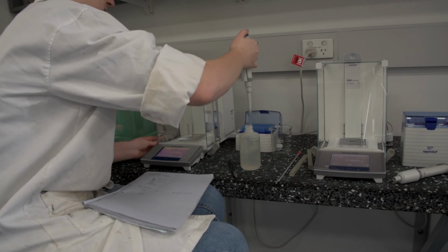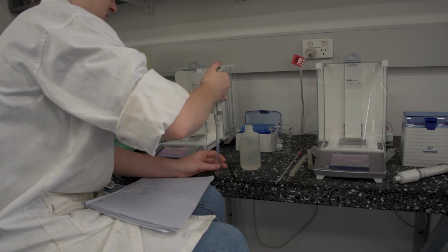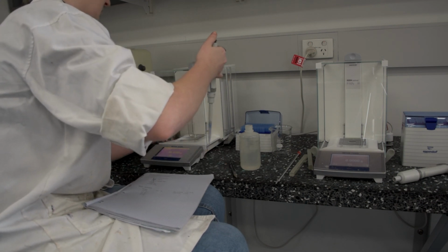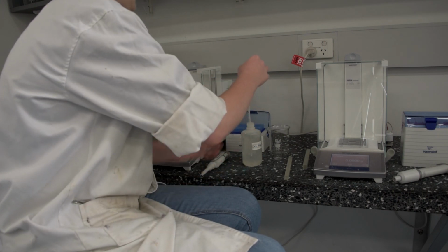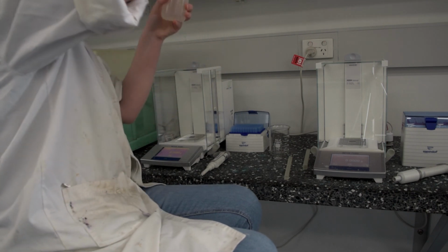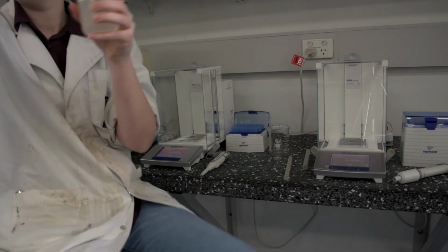To calibrate the autopipette, specific volumes of water were pipetted into a vial and weighed. The temperature of this water was measured, so the density of this water may be looked up in reference books such as the CRC Handbook of Physics and Chemistry. Several different volumes were used, so QT calib may be utilized to determine the real dispensed volume of water from the volume indicated on the pipette.